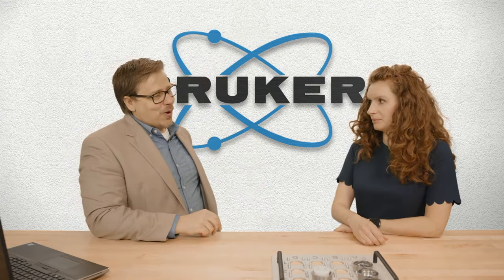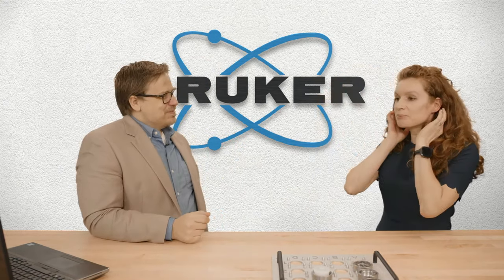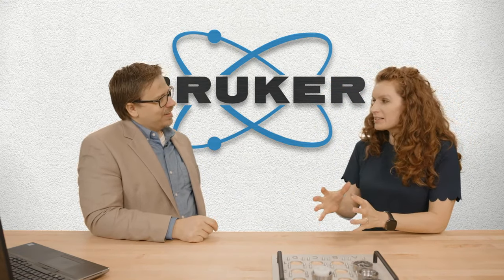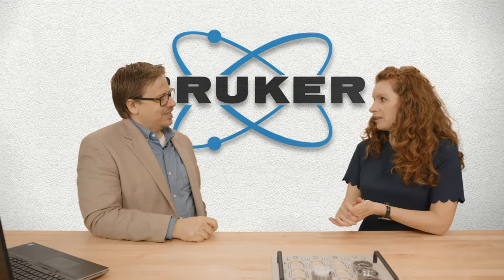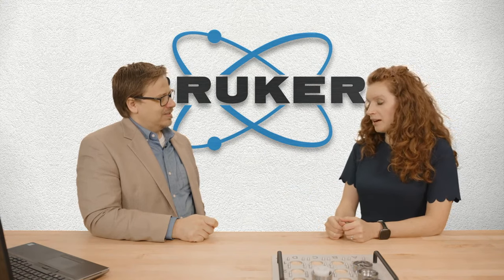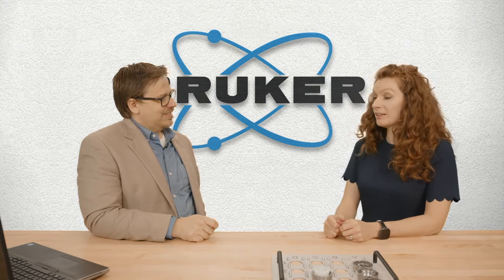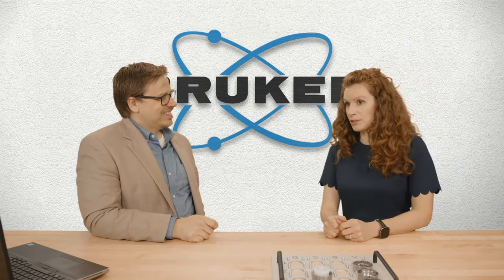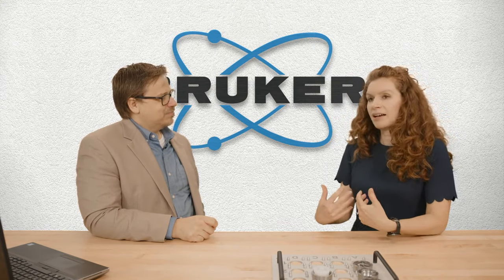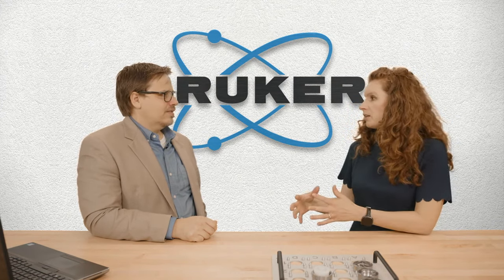And actually, this leads right into a question from Susan. And she works for a third-party lab and is asking, which machine is your favorite? Great question. My favorite actually is the 1 kilowatt because it hits kind of the sweet spot, right? It has the 8 crystals, the 4 collimators. You can measure anything. In fact, we screen pretty much everything that comes in with the 4 kilowatt, the 1 kilowatt as well. We sometimes even help out our colleagues in XRD. That is right. Yep. In case they see some structures that they didn't expect. And I have time. I don't need to run 100, 200 samples per day. So waiting a little longer is not a problem for me.